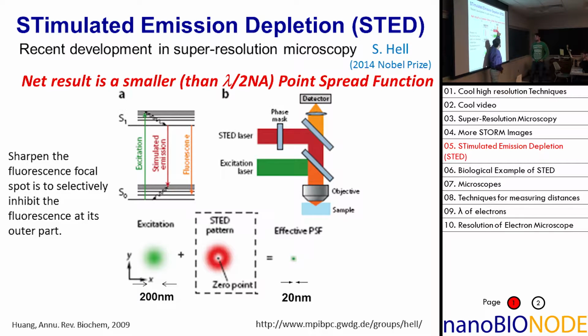What does it do to the red light? It reflects it. And what did we say it's doing to the orange light? It's passing through. Again, it's wavelength dependent. This is sort of acting opposite to this, in that this is bouncing short wavelengths, and long wavelengths it goes through.